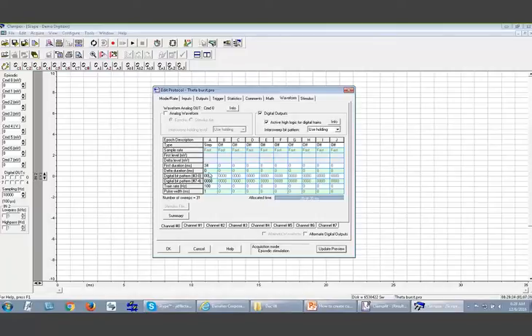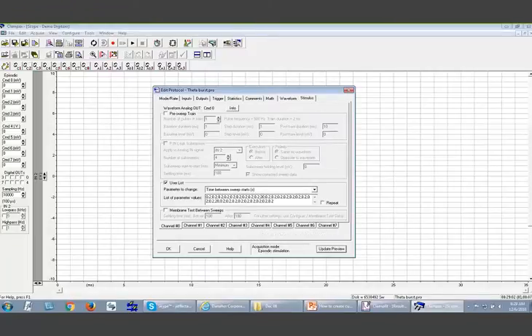Now, I want to use the user list. I want you guys to think big when you learn the user list. The big thing is that now I need to give 10 times, and in those 10 times, the interval is 200 milliseconds. And then wait for 20 seconds and give another 10 epochs. I use this user list.